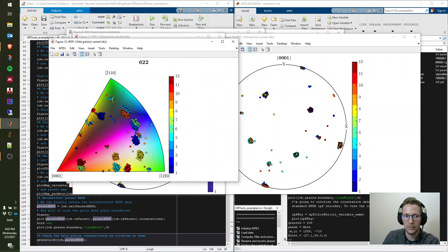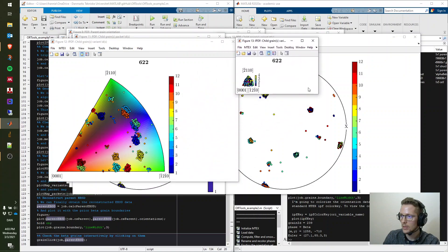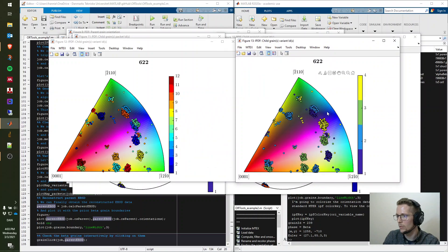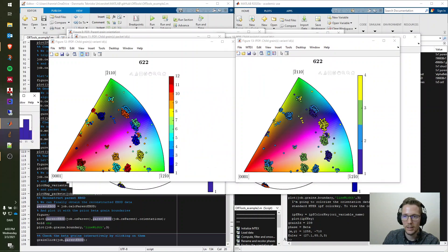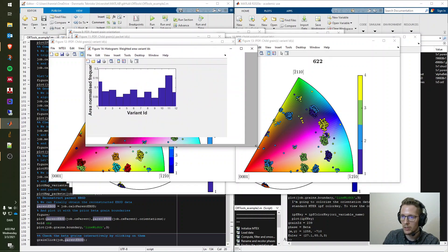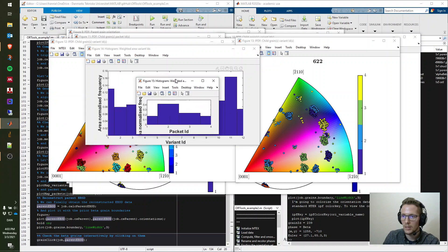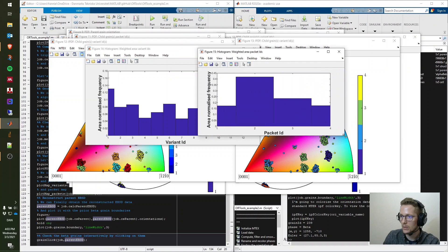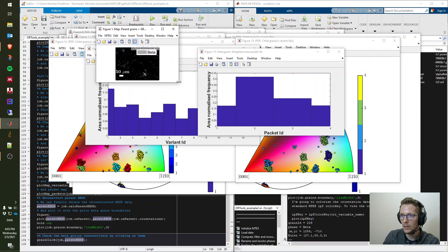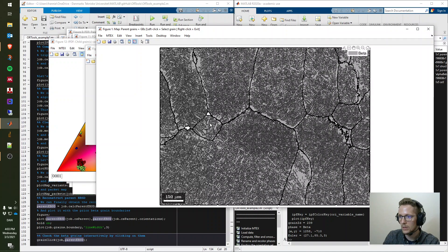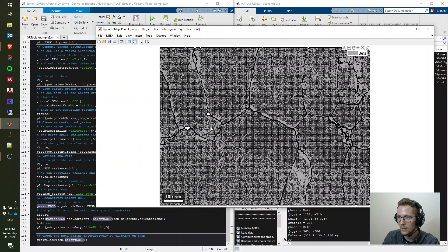The same pole figure analysis is done for packets. We also have the inverse pole figure with variant coding and with packet coding. Last is the variant ID histogram showing the area fraction of each variant — a quite even distribution — and the packet ID distribution showing how packets are distributed on the map. You can click another grain in figure one to continue the analysis, and right-click to exit the function when done.